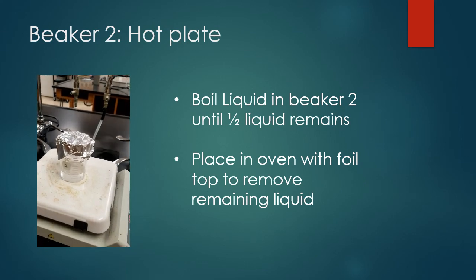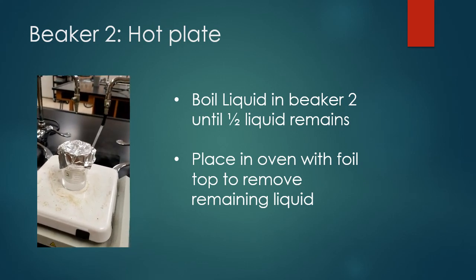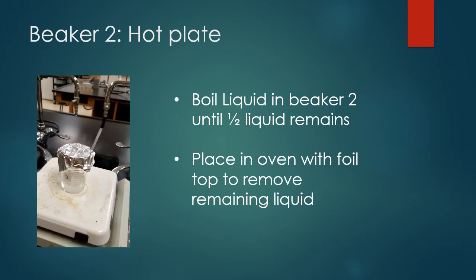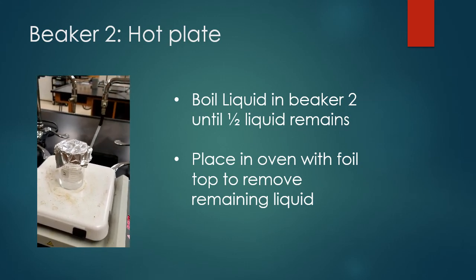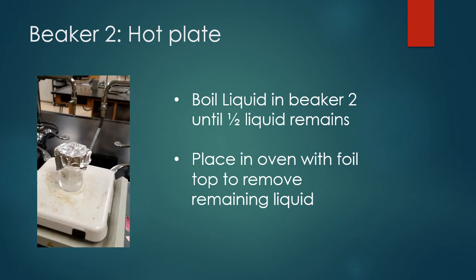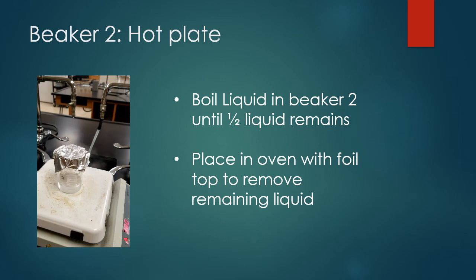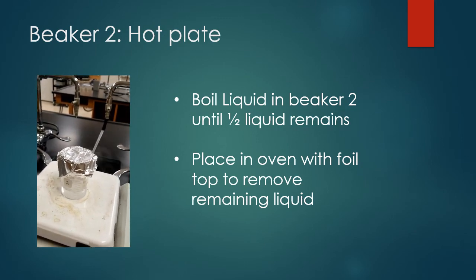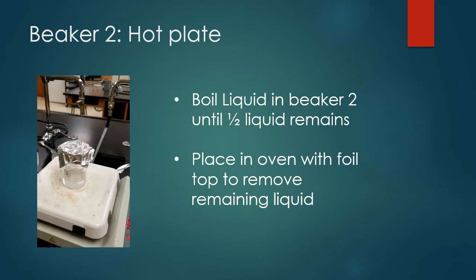That's why we took the mass of the tin foil as well. Once we get to about half the volume, we will place this beaker with the tin foil on it in the oven to get the rest of the water off. Then when we get back next week, I'll take the mass of it, and we will know the mass of the solid in beaker two that is soluble in water.